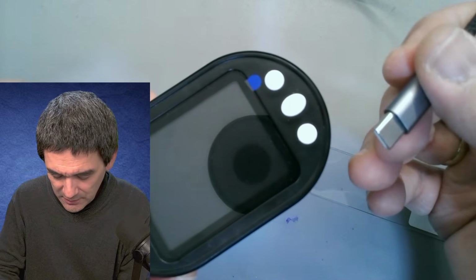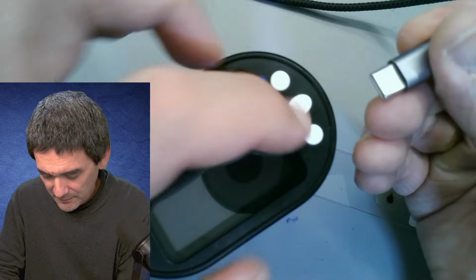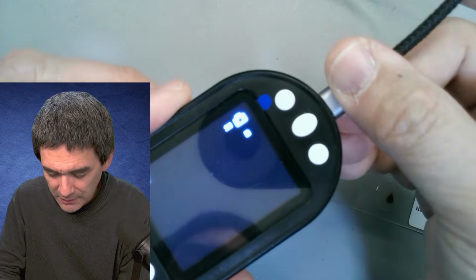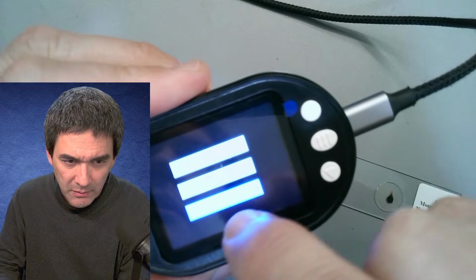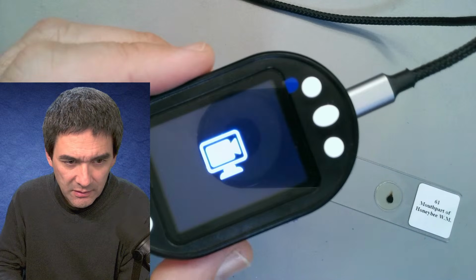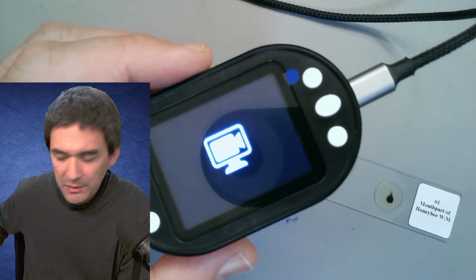Okay. Sometimes this actually does work. Because it's battery operated, I'm going to plug it in again. Here we go. I have video, memory, or PC camera. I want to have the PC camera. Maybe you cannot read that. I have to select it, and then back to the PC camera, and then I hope my face will also reappear again. And then here we are again. Hopefully we were before. And no, the frame is still frozen.